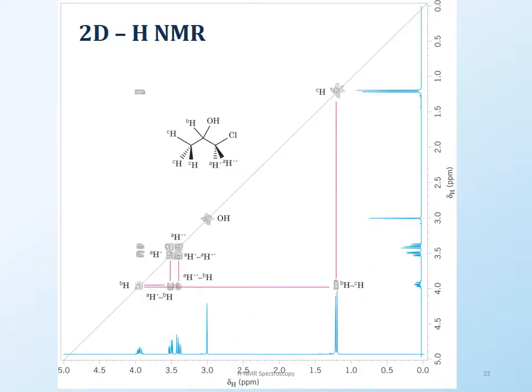And then finally, one of my favorite things is the 2D NMR. You will probably not see 2D NMR unless you are in a graduate program with chemistry. 2D NMRs are really fun, and this is a little bit more useful when you have complex splitting. When you have complex splitting and you really don't want to work with J's, then you do 2D NMR, which is two-dimensional NMR. You run the NMR in one direction and then you run it in another direction, and then you correlate the peaks. So you will see the same peaks on both sides.